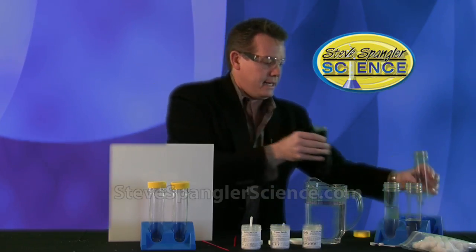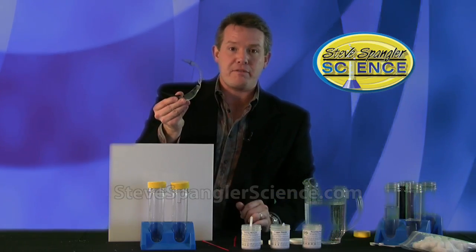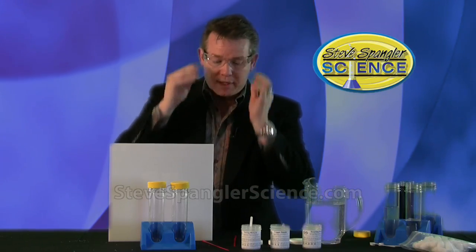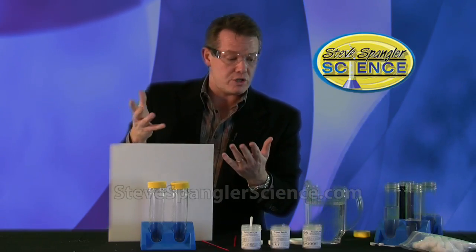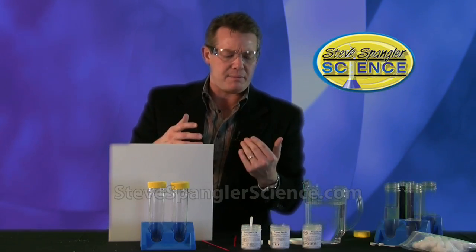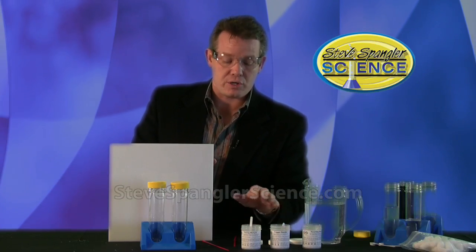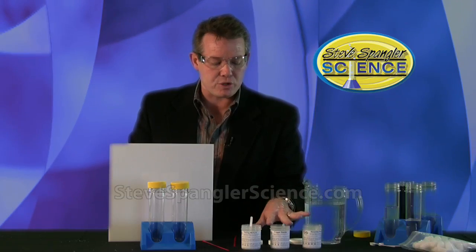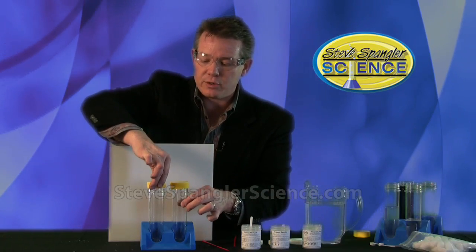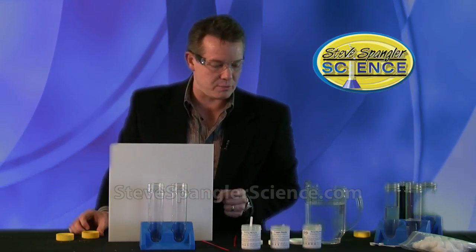Let me show you what you're going to get in the kit. First of all, most importantly, you have a pair of safety glasses — it actually comes in the kit — so we want to make sure those are on. This formulation uses fairly non-toxic chemicals; many of these are household-like chemicals. You'll see there are three jars: a timing powder, a trigger powder, and a recycling powder I'll tell you about in a second. We're doing the reaction in large test tubes, and you have a test tube rack as well.